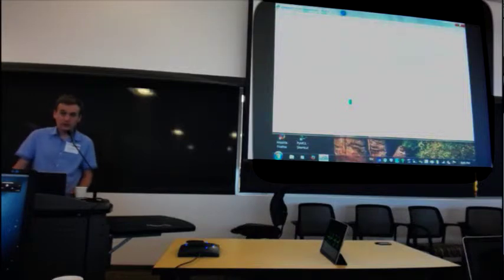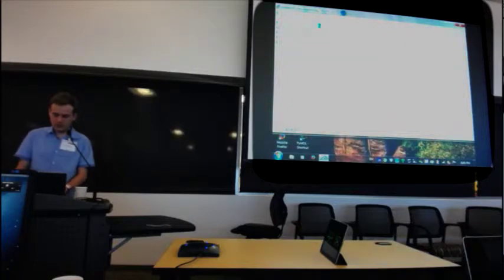To change the queue name, you have to edit this file, which is run template LCLS, and change that to the PSN CS queue. I think that will work better given the number of people we have.